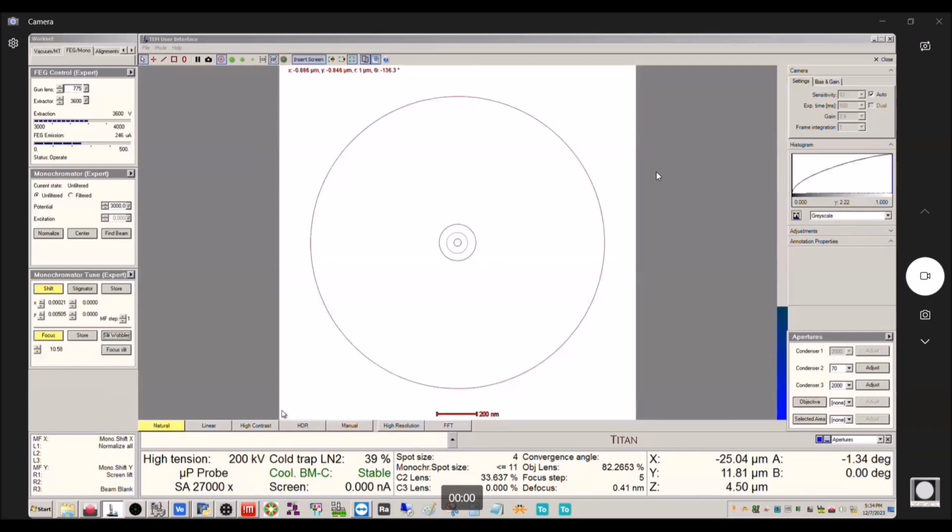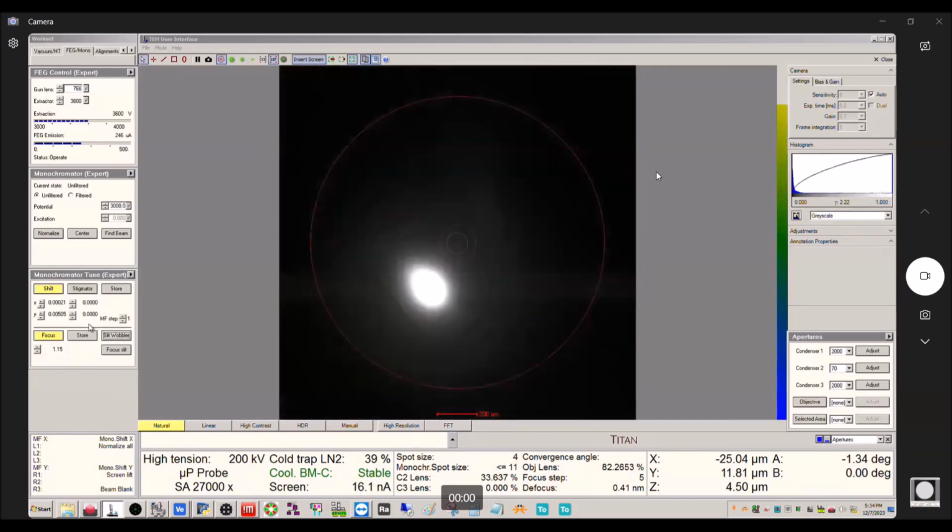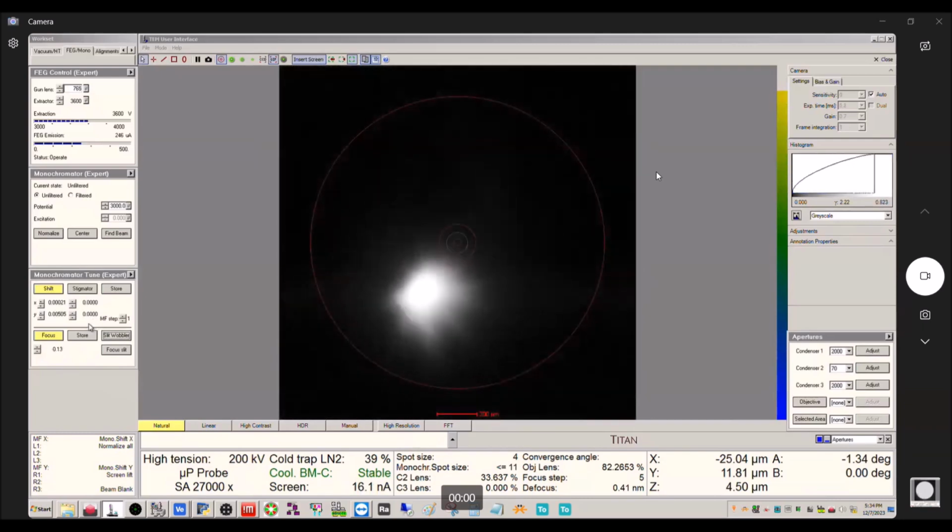And then I can take this out, turn off the slit wobbler. And now when I focus, you can see, when I'm at focus here, when this is at crossover, this should be close to 0. Okay, so this is pretty close. I could probably tune this a little. So right here, I could push store and that sets it to 0.